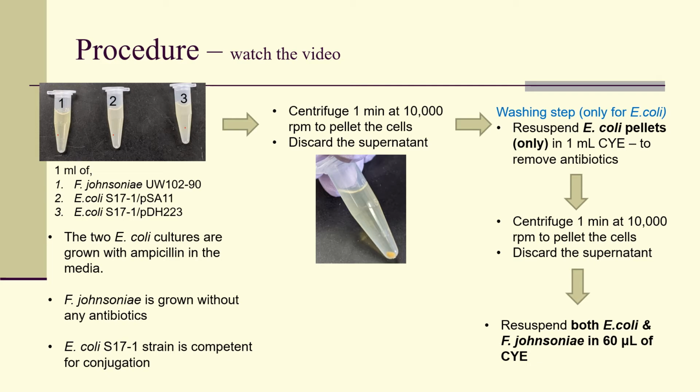Next, we will resuspend both E. coli cell pellets and the Flavobacterium johnsoniae cell pellet in 60 microliters of CYE.